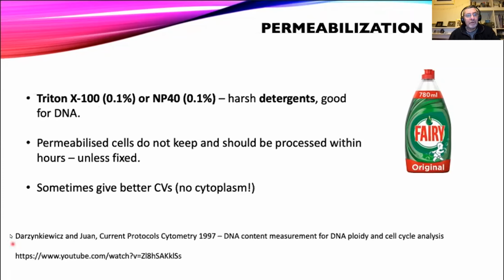I'll just put a couple of resources in here as well. This is quite an old paper from Current Protocols in Cytometry from Zbigniew Darzynkiewicz and Gloria Juan. But a lot of the protocols have not really changed for many years, so this is a great resource if you can get hold of it. And this URL here points to a talk I gave at Flowtex last year, talking about fixation and permeabilization.